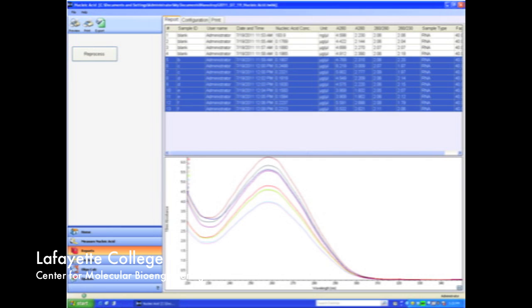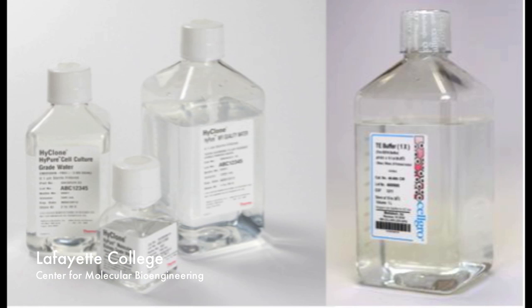The 260-280 ratio is the most important, but when harvesting the RNA in water, it can be as low as 1.85 and still be pure. If you have low concentrations of RNA harvested in water, lower ratios are common. To avoid this problem, harvest in an alkaline buffer with a pH of 7.5 to 8.5, such as buffer TE with a pH of 8, for a more accurate reading.